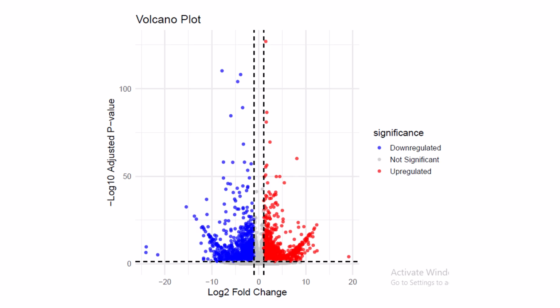So genes appearing higher on the plot are more statistically significant. The red and blue points represent significantly upregulated and downregulated genes respectively, while the gray points are non-significant genes. This plot clearly shows the magnitude and significance of differentially expressed genes, allowing us to rapidly identify the most responsive candidate genes.